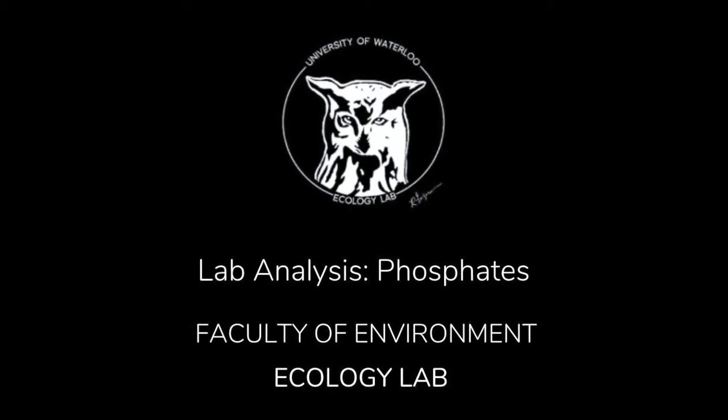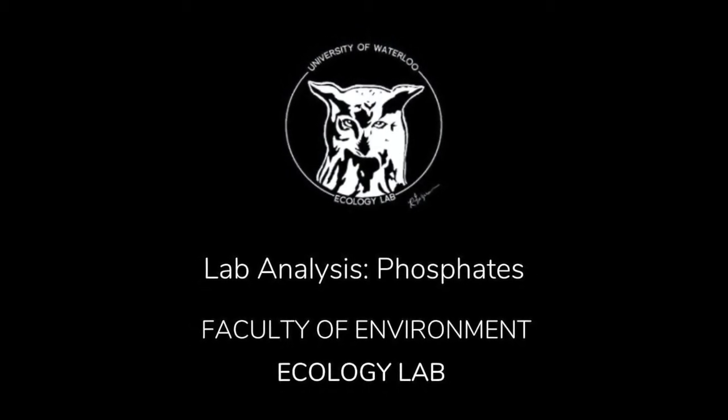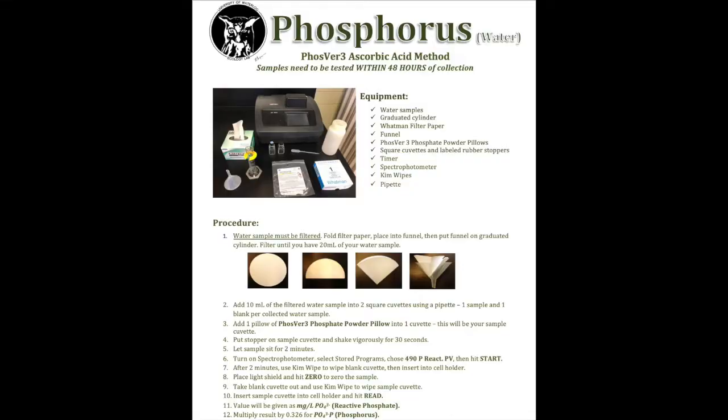The Faculty of Environment Ecology Lab staff will demonstrate how to determine phosphate levels in your water sample using a standard method known as the ascorbic acid method. Note this is a time-sensitive test that needs to be completed within 48 hours of obtaining your water sample.